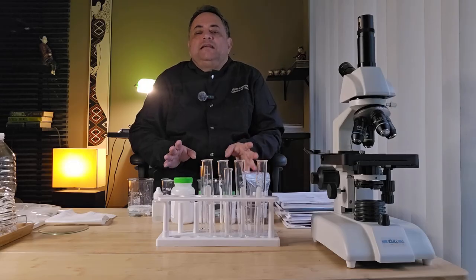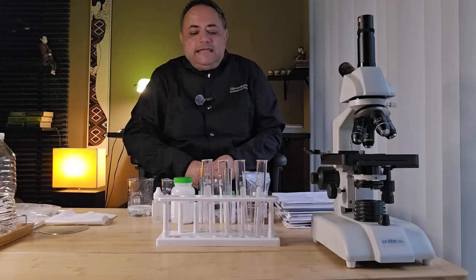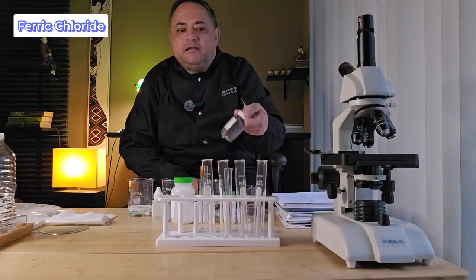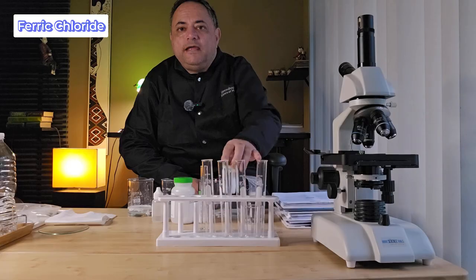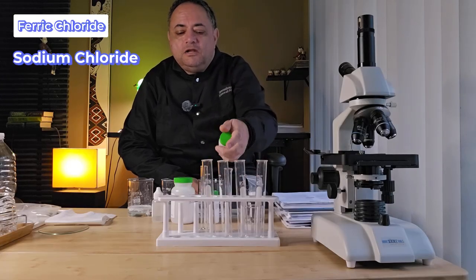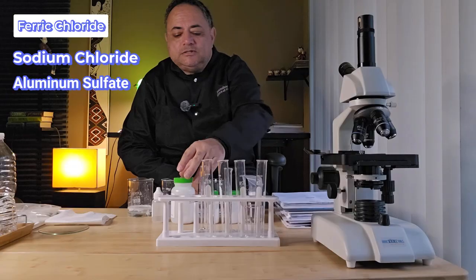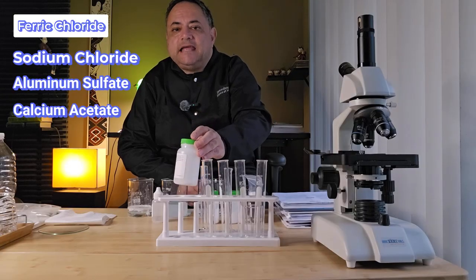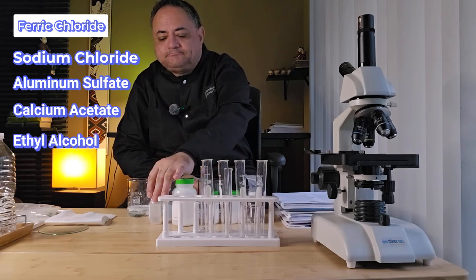For the two different experiments we're going to do, we're looking at the sol. You're going to need iron chloride, ferric chloride. You're going to need sodium chloride, aluminum sulfate. You're going to need calcium acetate, and we're going to need alcohol, ethanol.